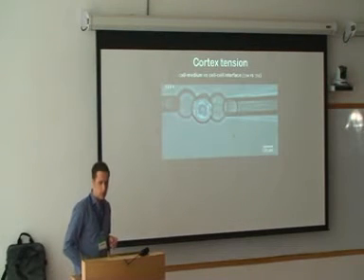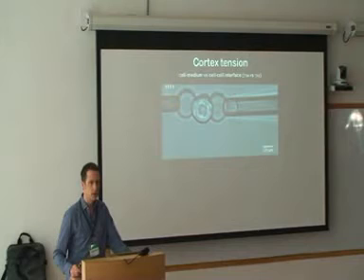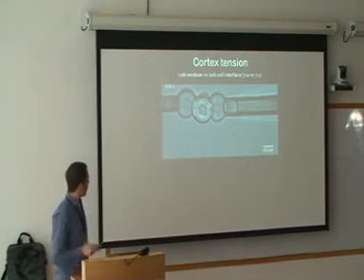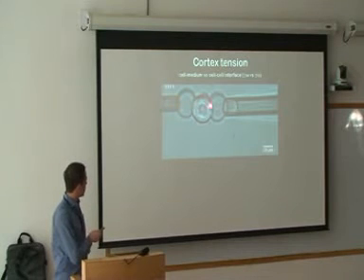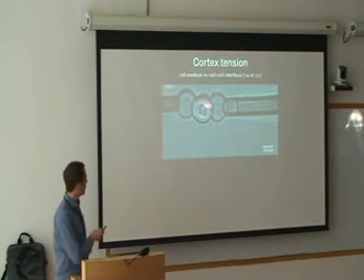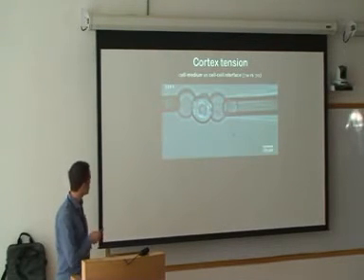Another way is a much more accurate way, and this is interesting now in the context of a technique lecture here, using micropipettes again. Now what we are doing in this experiment is we are creating a triplet of progenitor cells, a homotypic triplet of progenitor cells. These could be all three ectoderm or mesoderm or endoderm. And we are holding this triplet with two micropipettes, under pressure here, under pressure here.